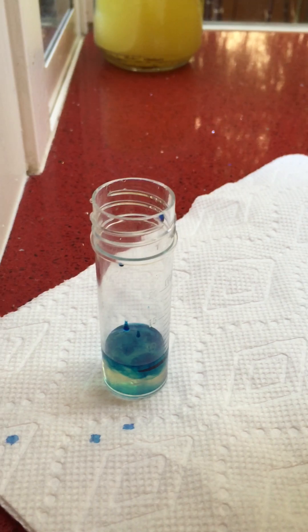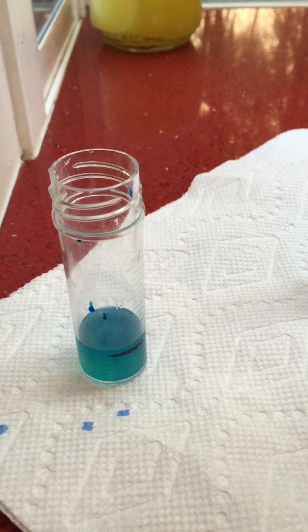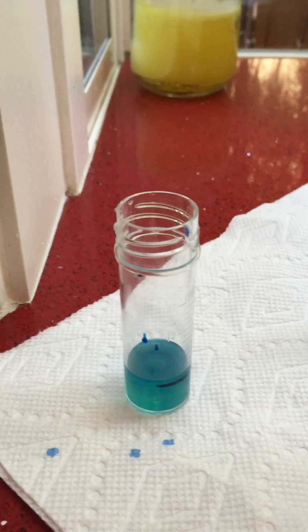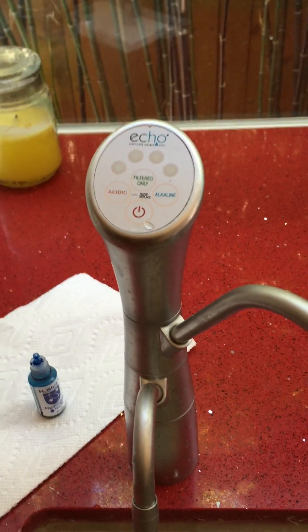Twelve, thirteen, fourteen, fifteen. Let's see if that's gonna stay blue or turn back white. Okay, so basically I put 15 drops in before it stopped turning white, so I'm gonna say that my water has 1.4 ppm — parts per million — of dissolved molecular hydrogen.